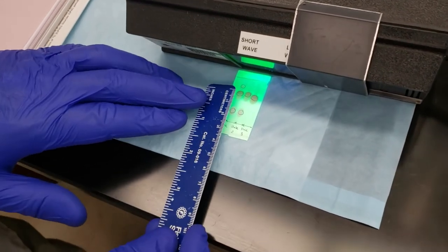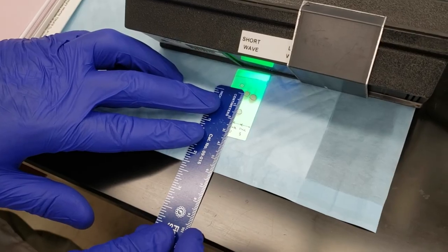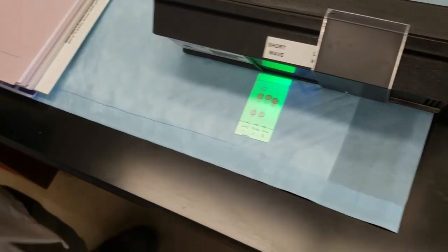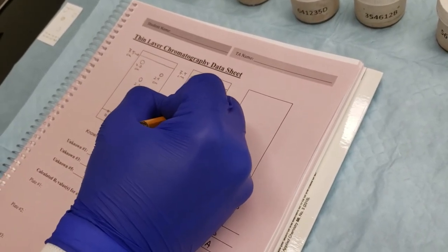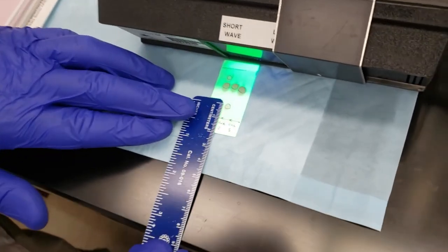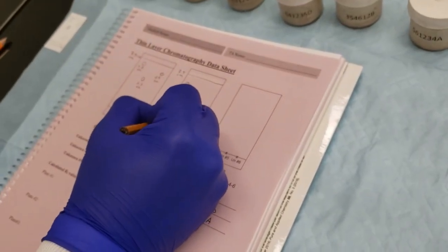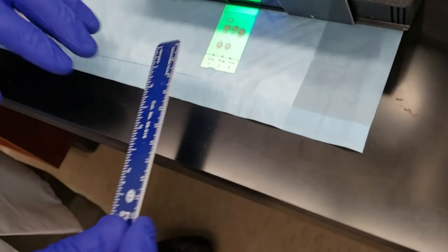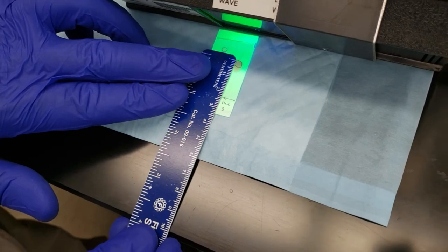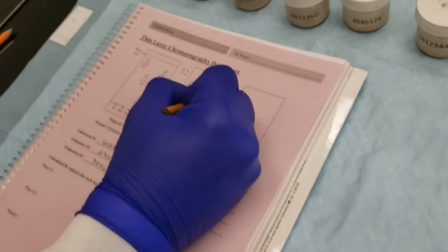Let's take a look at unknown number two. We've got two spots here. Measure this one from the midline. We're at 2.2. The bottom spot is right at 0.9. And those numbers sound very familiar. Now let's look at unknown number three. We've just got a single spot, and that single spot measures out at 2.2 for unknown number three.